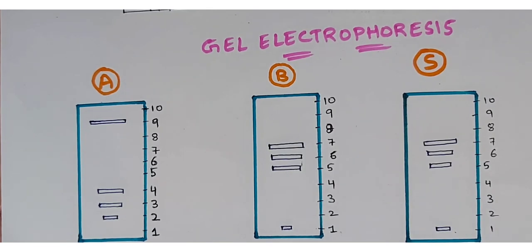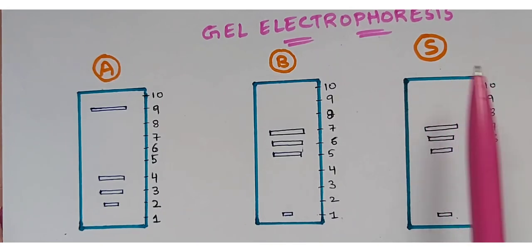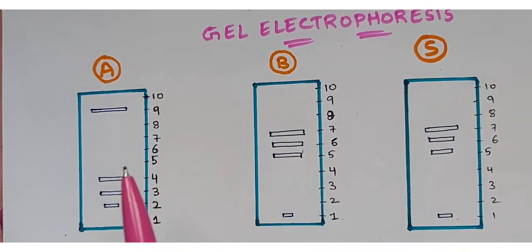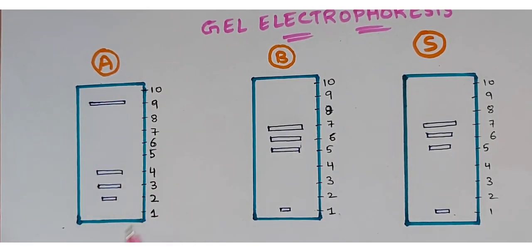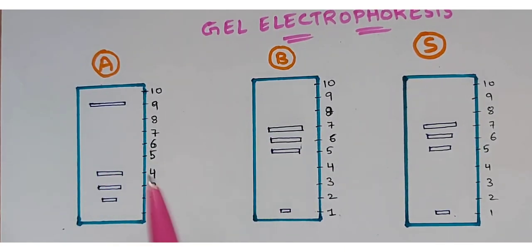Now what are you going to do? Try to keep this aside. Okay, keep this aside. I will explain to you later. Firstly, focus on these both. Now what you're going to do is take agarose gel plates. Okay, so this is an agarose gel and this is another agarose gel. You are going to take 2 because we have chosen 2 individuals, right?